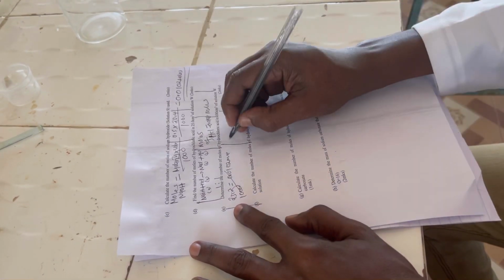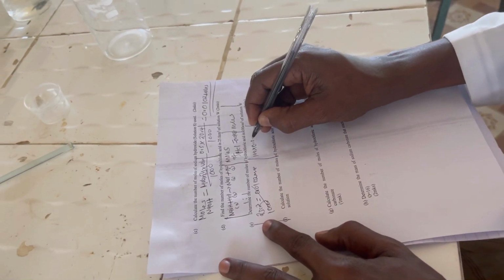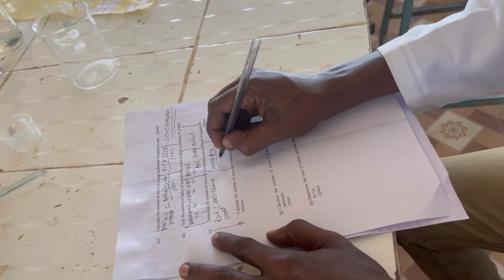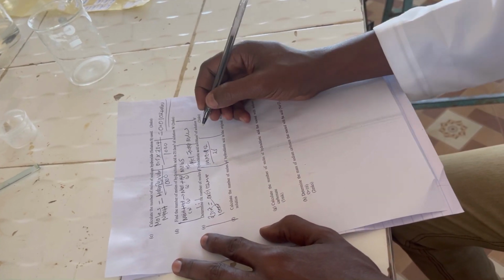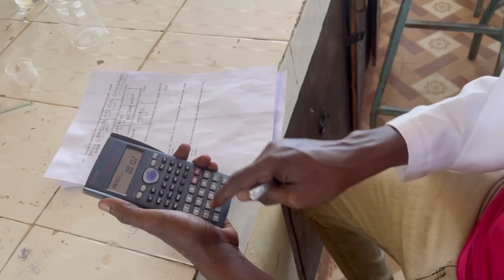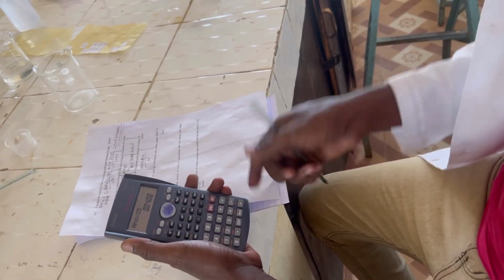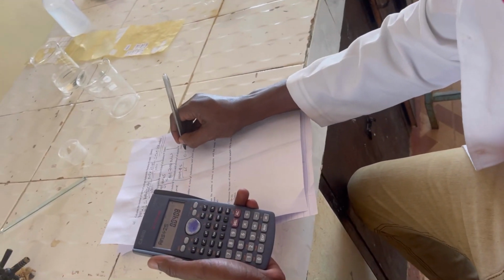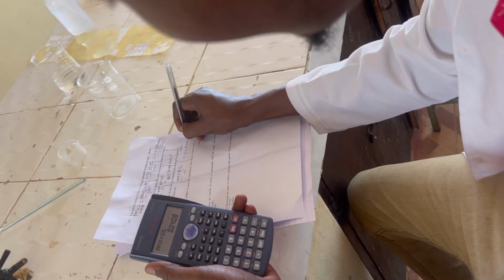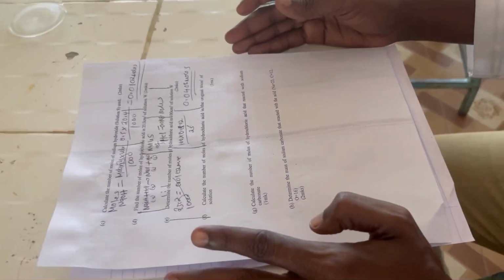So it will be 100 centimeter cube times 0.01021, then divide by 25. So that is 0.0408 moles. So this is the number of moles of the hydrochloric acid in 100 centimeter cube of solution W.